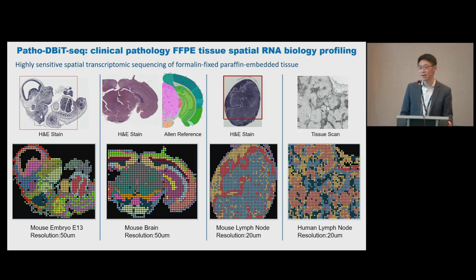All right, so recently we found, actually quite a number of years ago, we found this actually works on FFPE. This overall approach is very versatile, and in general we can get much better gene counts and UMI counts. But FFPE samples are still challenging. Over the past 2 years, we really worked hard to make it fully compatible with FFPE samples.